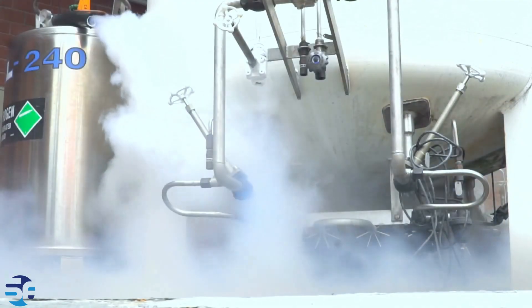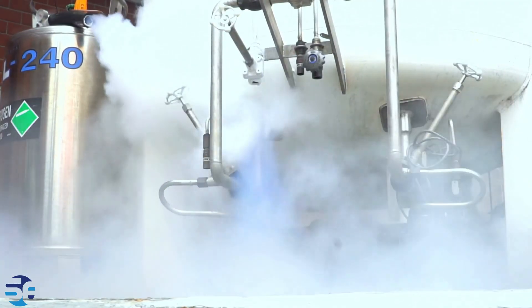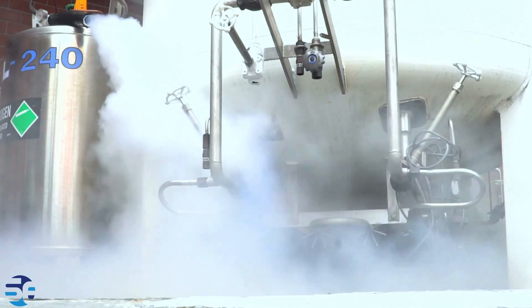The reactor includes a heating system to control and maintain the desired temperature for the chemical reaction. This could involve electric heaters, external heating jackets, or other heating methods.